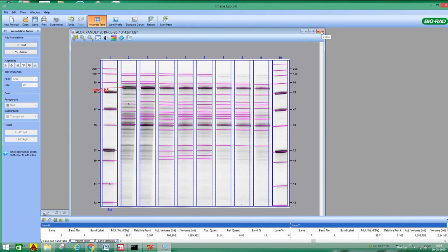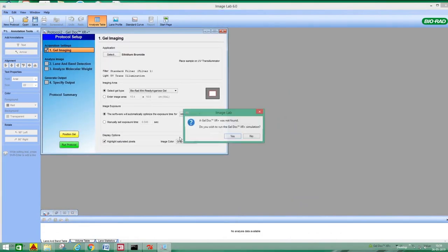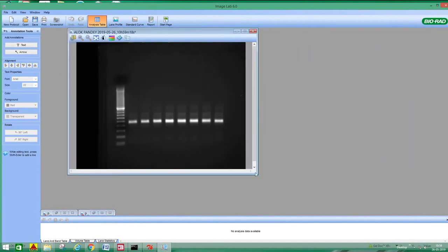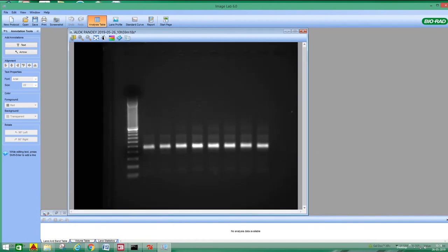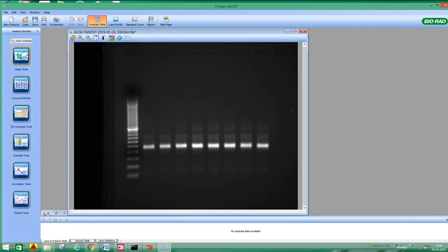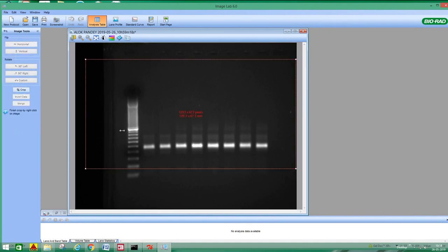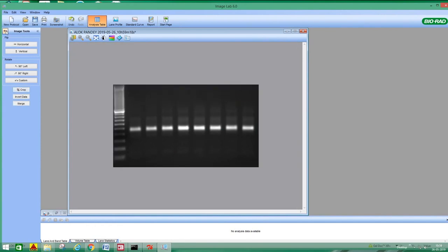So now I want to do the same analysis for the nucleic acids, suppose DNA. So now you have DNA. All the part is same as compared to proteins. So you can go to image tools for cropping, you can crop it, or whatever the part you want to keep, you can keep that one and say crop.